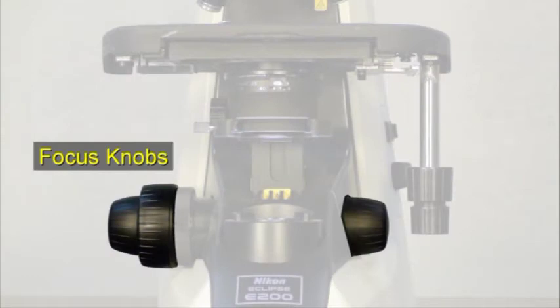Image focus is accomplished by focus knobs on either side of the microscope. These move the stage up and down to focus the specimen image.